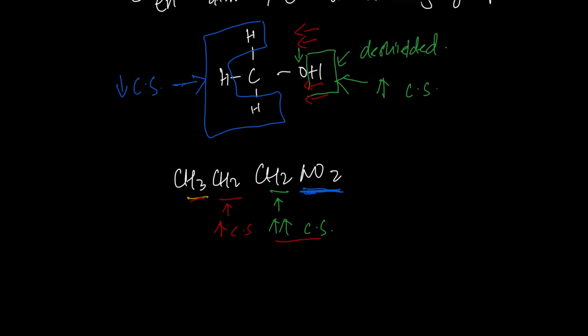And for this proton, it is the one among these three furthest away from the electron withdrawing group NO2, so it has the lowest chemical shift value.